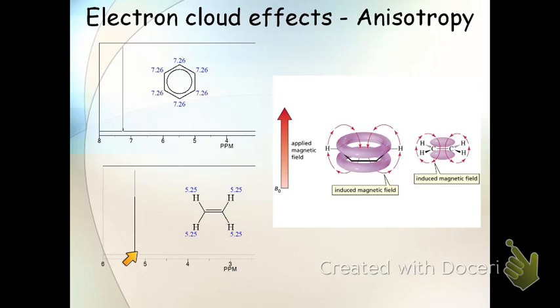There's a number of things that can be in that range, but typically if you think you have a double bond, you would see these hydrogens in the IR spectrum just to the left of 3000, and then you would also expect to see, if you have that, signals between 5 and 5.5, maybe 4.5 to 5.5 parts per million. So those are offset quite a bit, and this effect is known as anisotropy, that is a locally induced magnetic field.